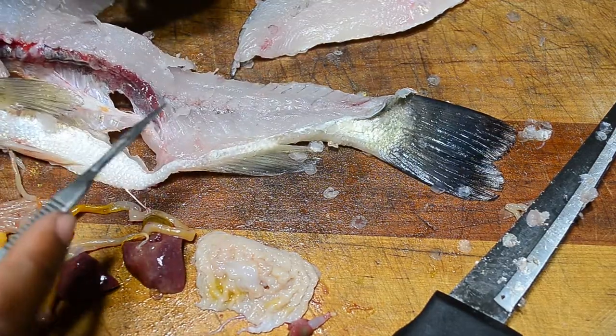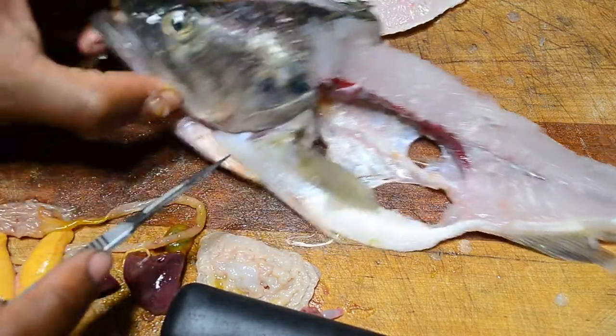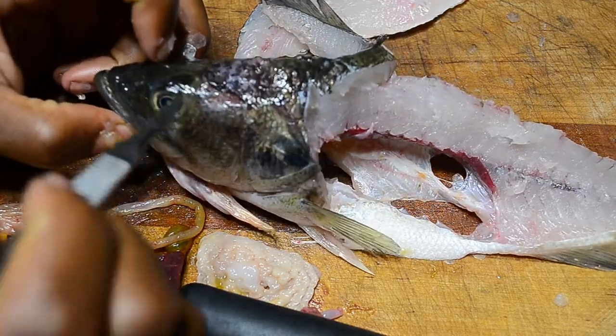That meat there is edible. You can eat the eyes too — let's see if we can take out the eyes.